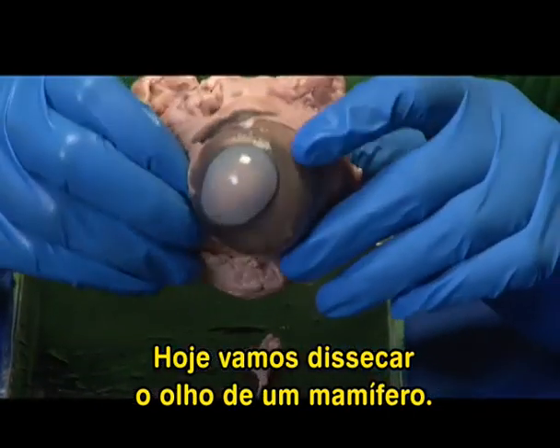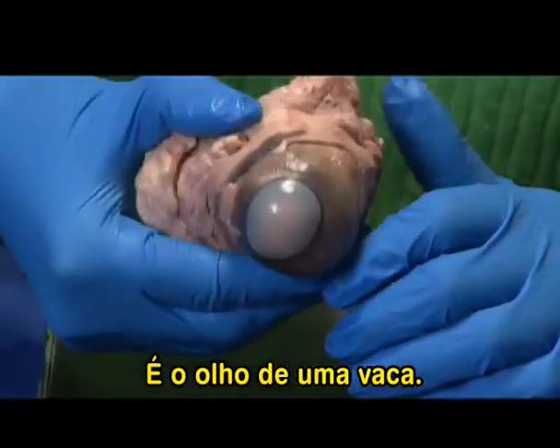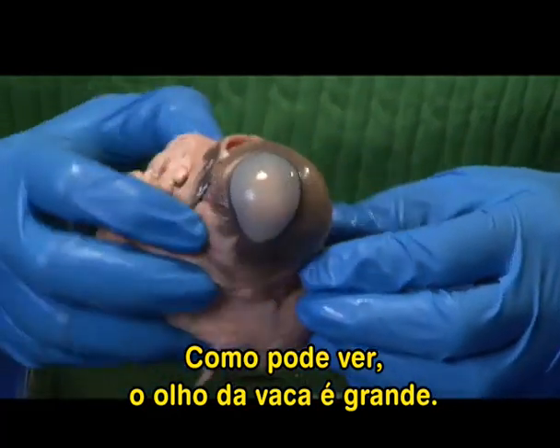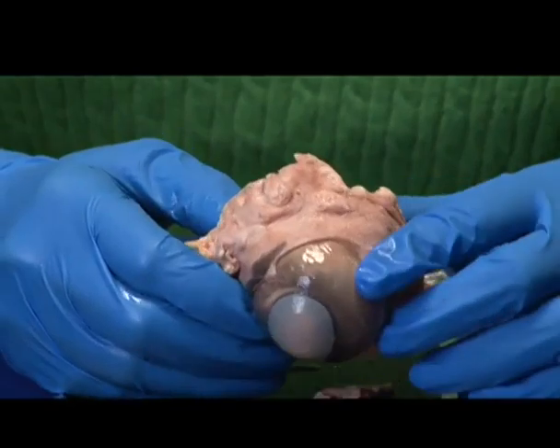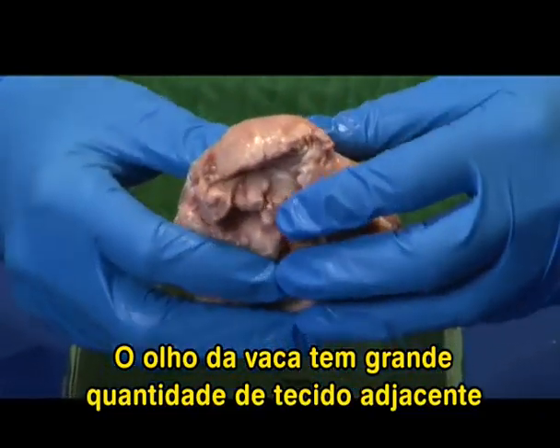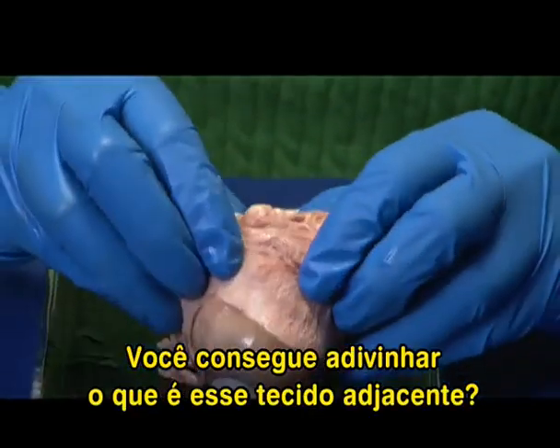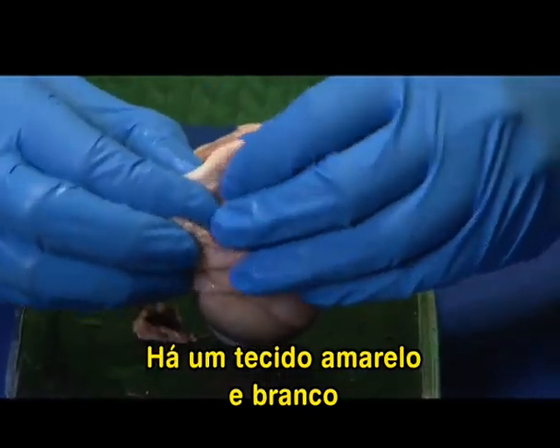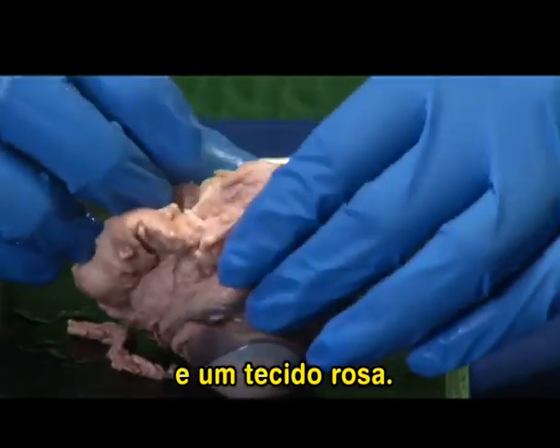Today we are going to dissect a mammalian eye, and this is actually a cow's eye. So as you can see, the cow eye looks fairly big. It's a little bit bigger than our eyes. The cow eye has a lot of surrounding tissue around the eye. Can you guess what this surrounding tissue is? You see some tissue that's yellow and white in nature, and some tissue that's pink in nature.